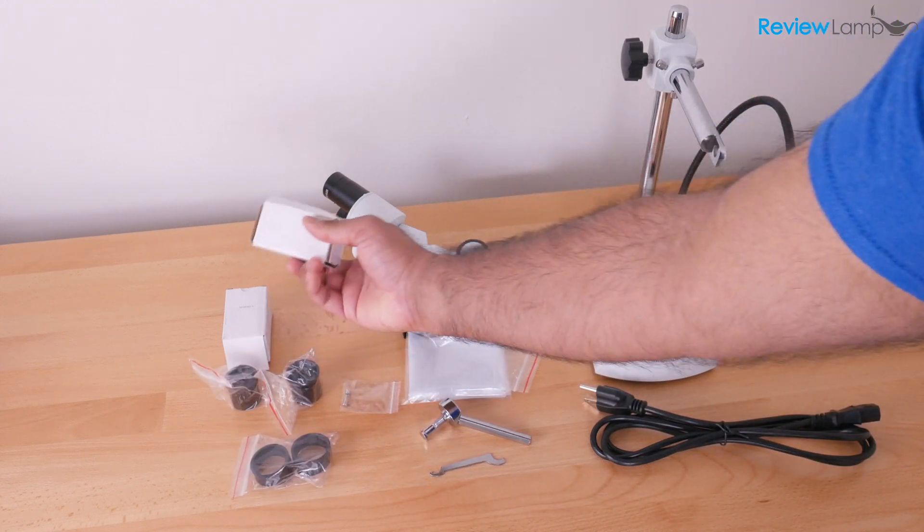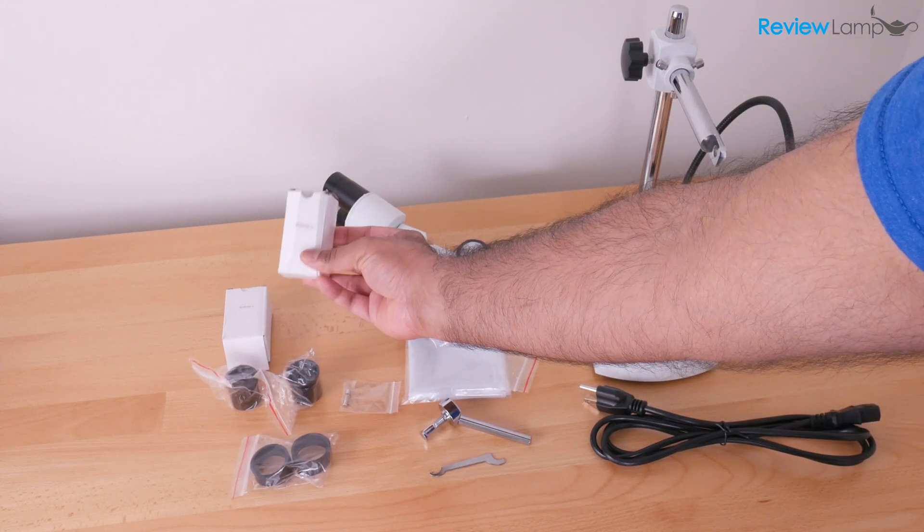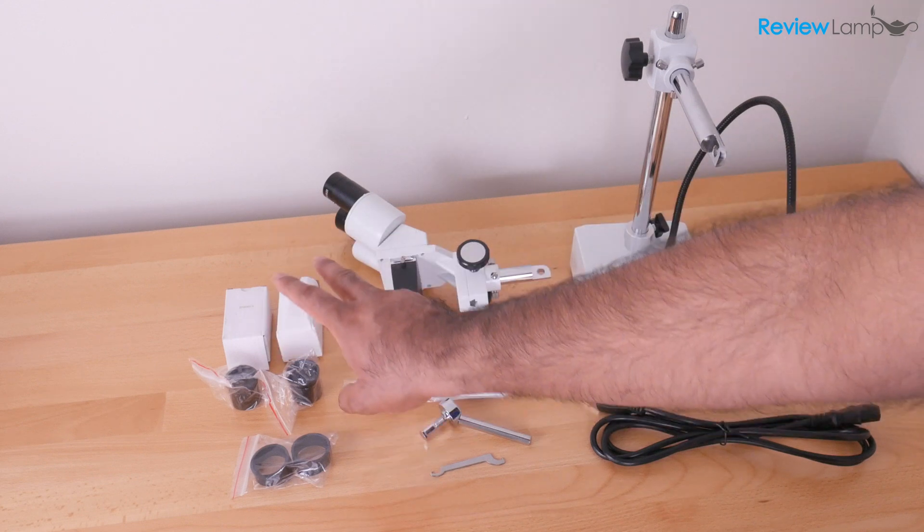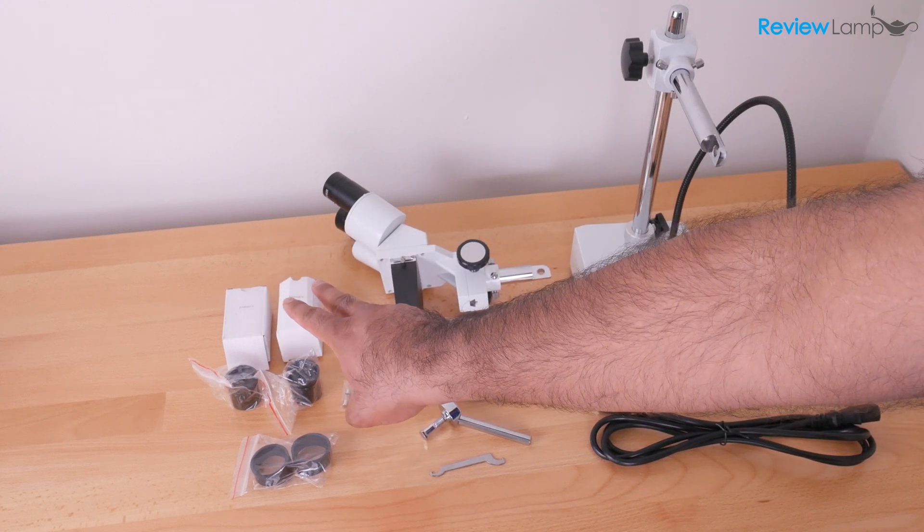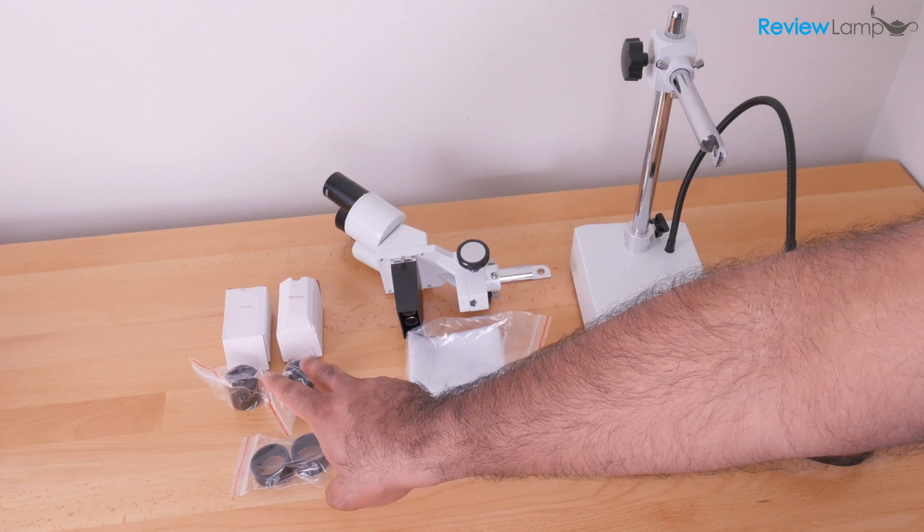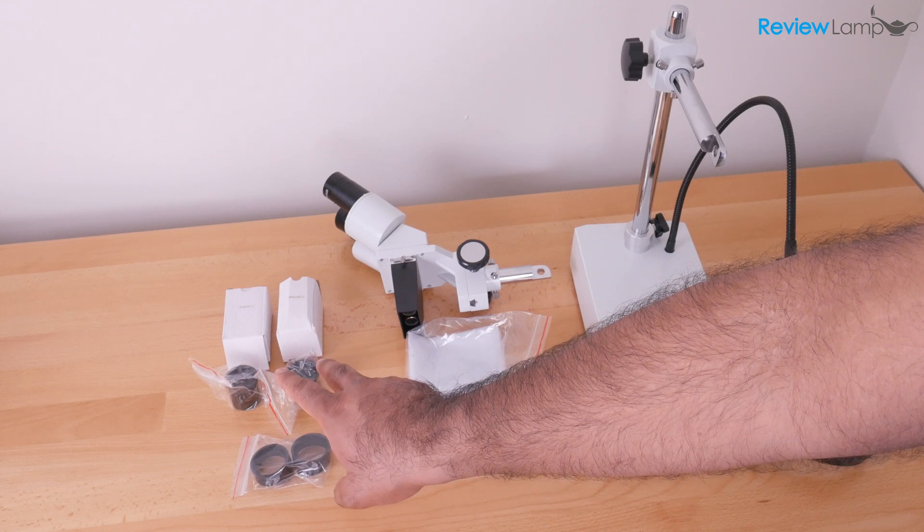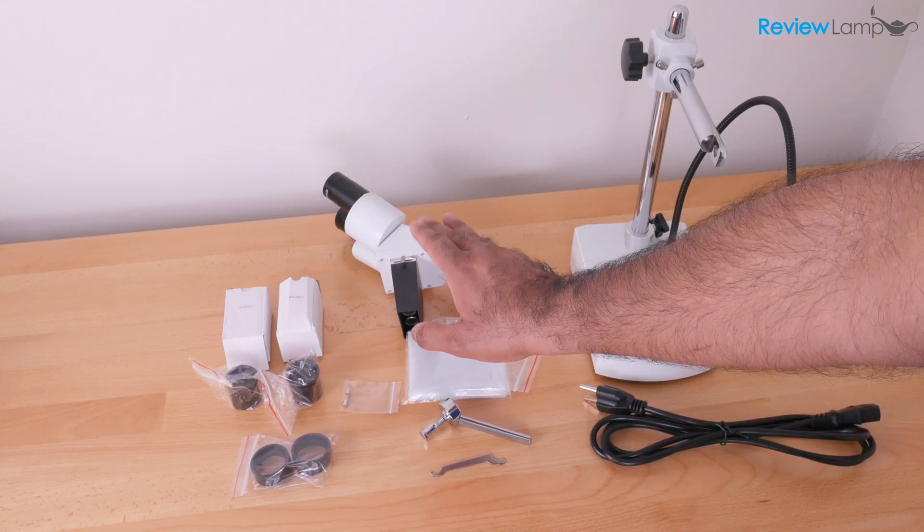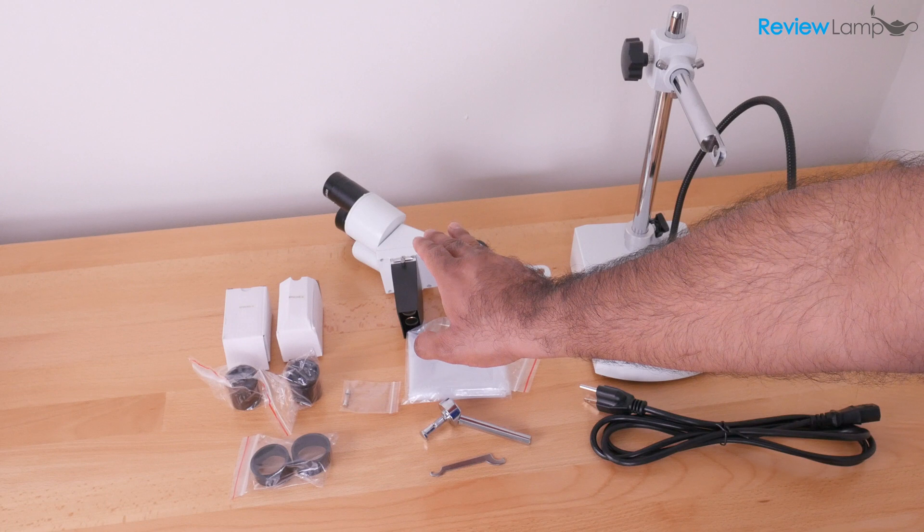This set also comes with three different magnifications of eyepieces. I have a pair of 5X magnification eyepieces, a set of 20X magnification eyepieces, and a set of 10X eyepieces already installed on the microscope head.